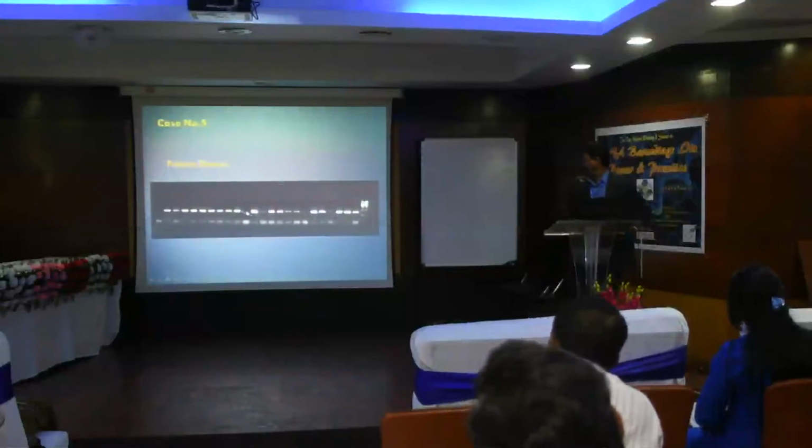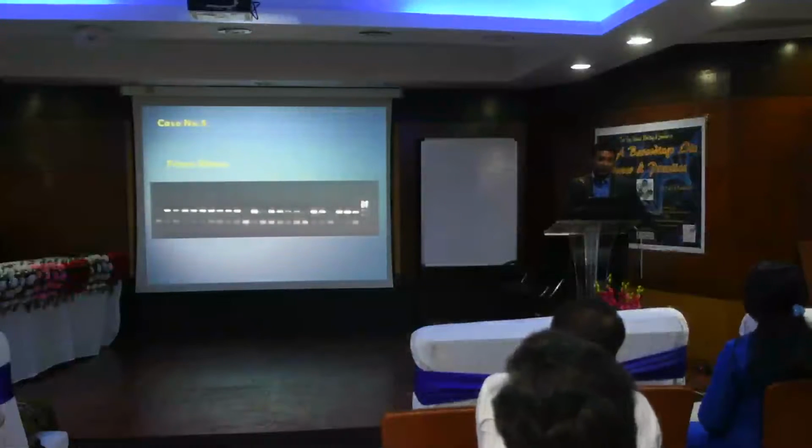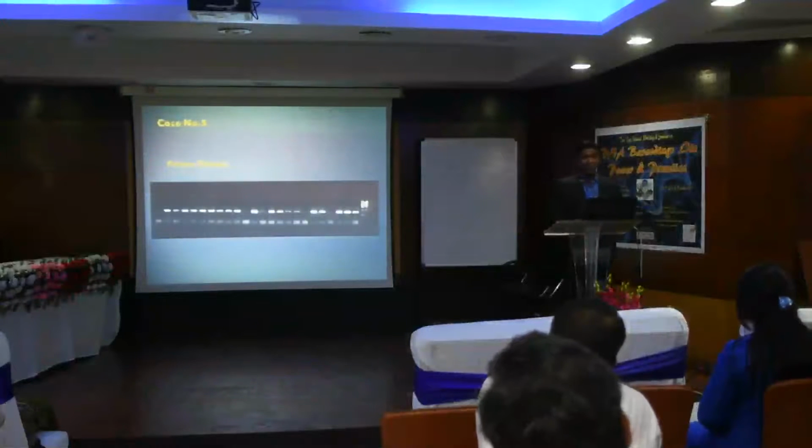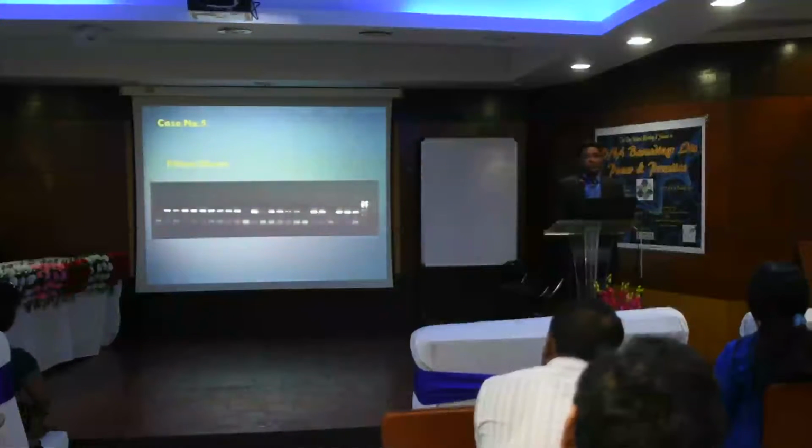You see, these are although not big primer dimers, but in some cases differentiating between primer dimer and template is very difficult, like a PCR product. Once I got one sample from one of the laboratories and they said all primer dimers only, but they were thinking there was no band, only primer dimers, and they were considering this a PCR product. And actually he was not believing me. I said no, this is not a PCR product, this is a primer dimer. And now we are doing the same, like it happens.